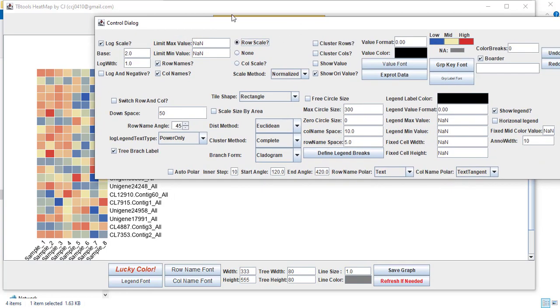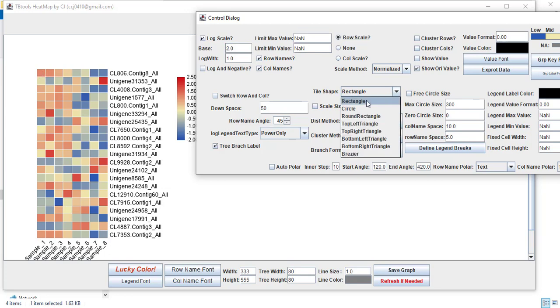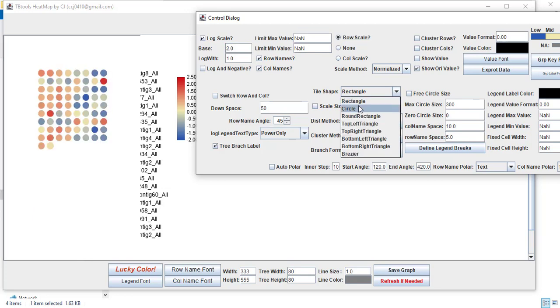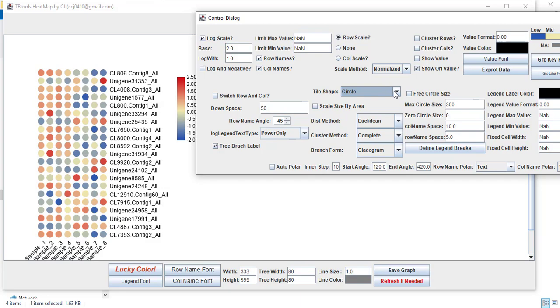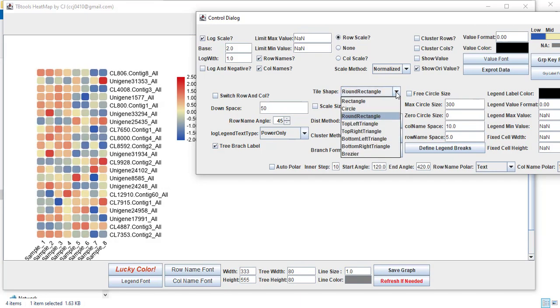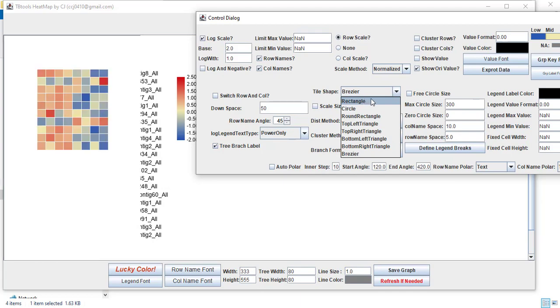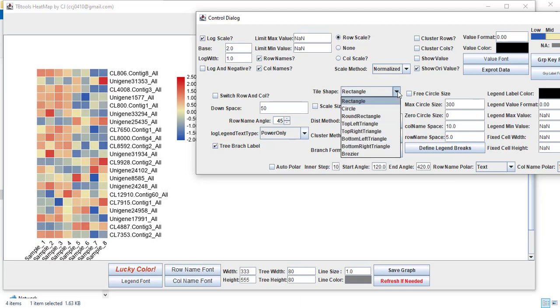Moreover, you can change the shape. Here the heatmap is in rectangle form. You can change it to circular, rounded rectangle, or any other form available. There are many options — you can choose any shape you like.